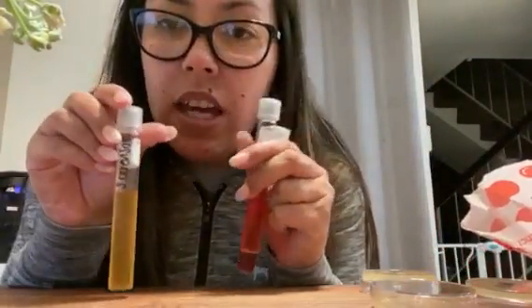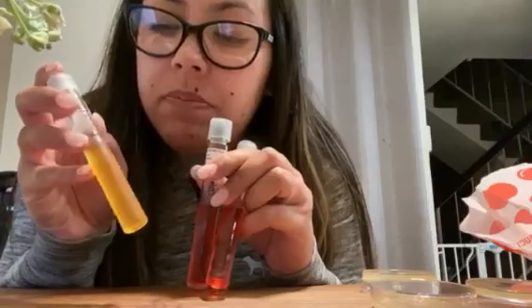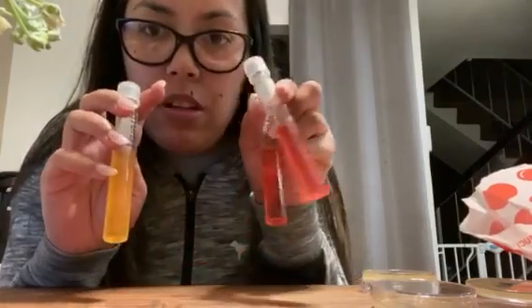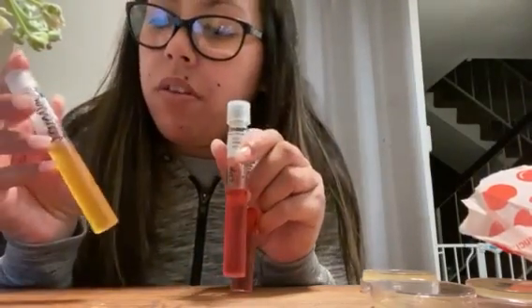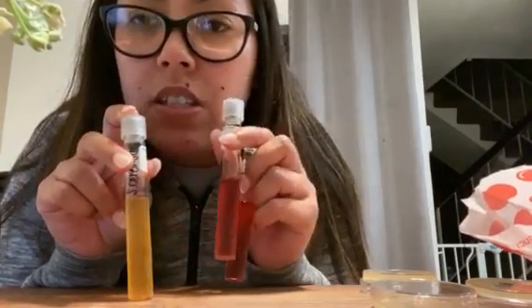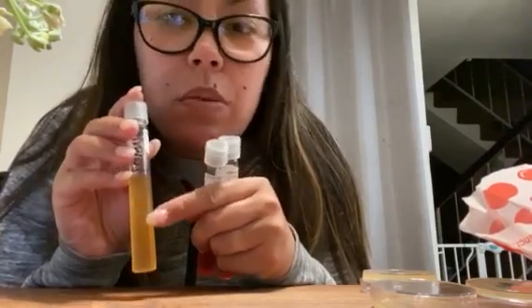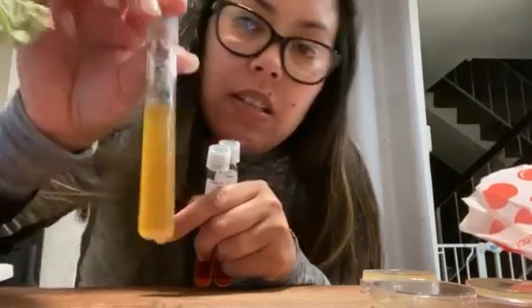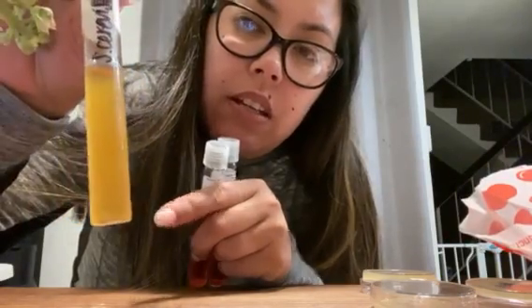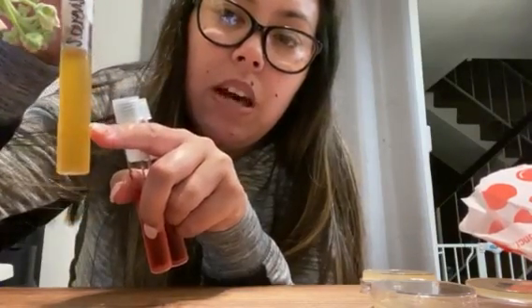And this is the S. cerevisiae, so this has developed into a completely different color. It's yellow, and it was originally the same color as these two, the light, red-tinged, pinkish broth color. So this one turned yellow, and it seemed to develop a lot faster than these two samples. The turbidity in this one was pretty moderate. You can still see that it's pretty cloudy. It just looks a lot thicker, and it's a little bit clearer up here at the top of the tube, and then really cloudy towards the bottom.